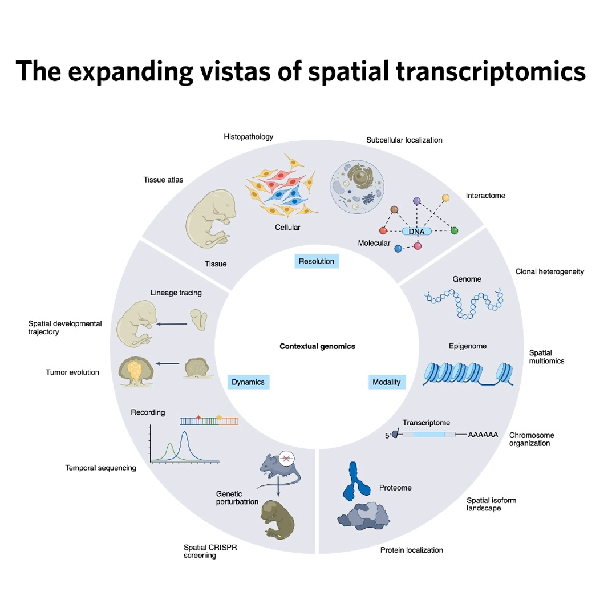Okay. And then on the other side, you had the targeted tools, things like advanced staining or in situ hybridization. Right, and those were fantastic for localization. They could show you exactly where a specific molecule was sitting within an intact cell or in the tissue structure, really precise where. And here's the other side of that coin. Those tools only let you look at maybe 5 or 10 specific molecules at once? If you were lucky, yeah. Maybe a few more with fancy microscopy, but nowhere near the whole picture. It was like confirming the existence of a few key screws in the car, but completely missing the overall engine design or the chassis structure.